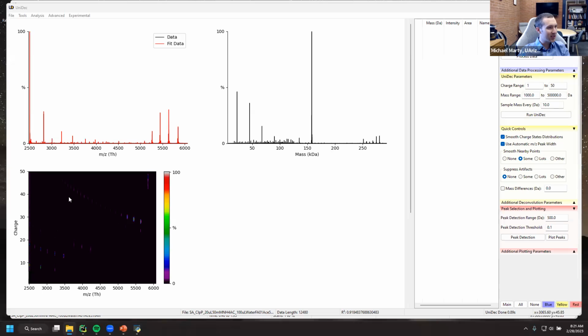I would say we do see some signal here. I'm not sure whether I believe that. Do you think these other things are real proteins in here, or do you think that's just artifacts from regularly spaced signals? So I would expect some monomers as well.